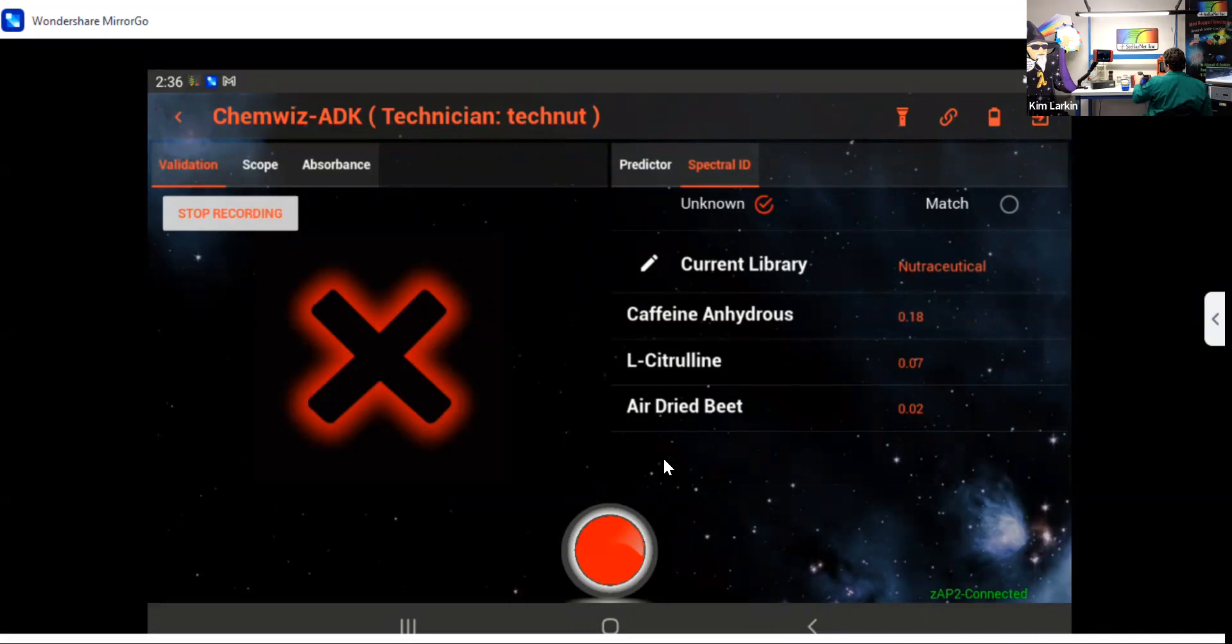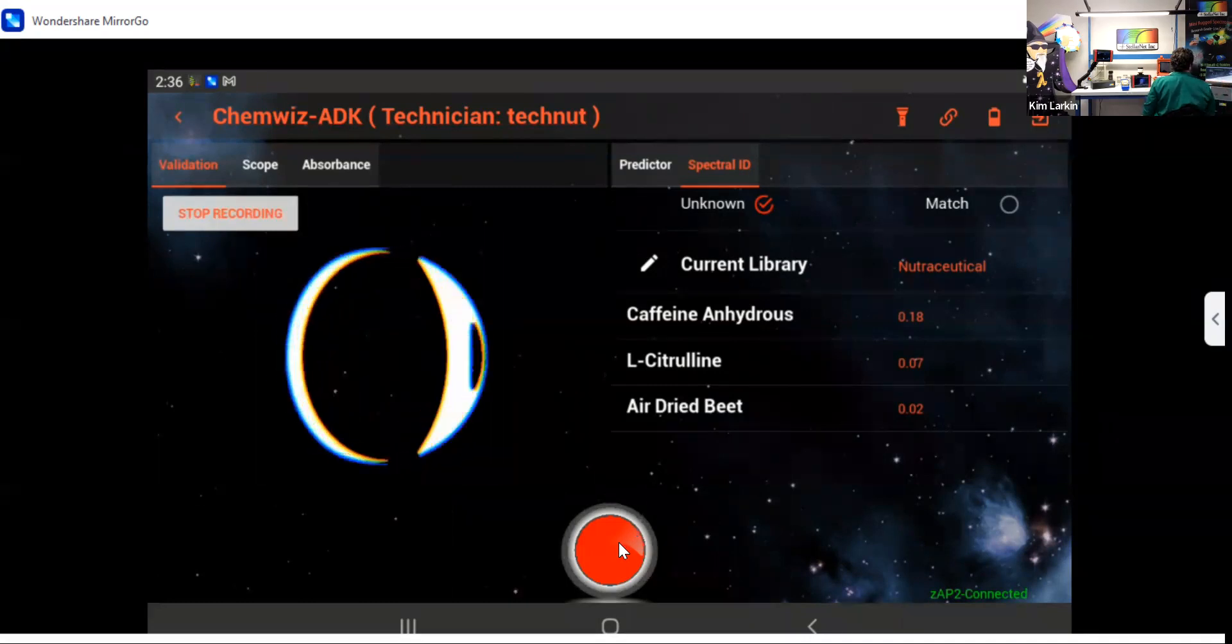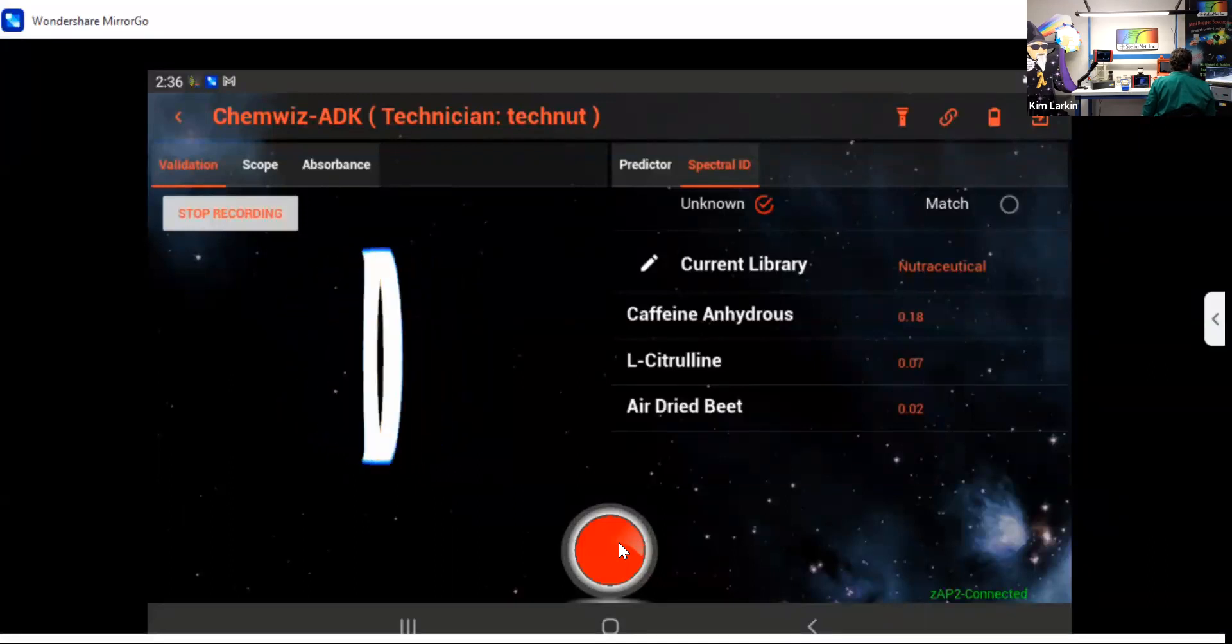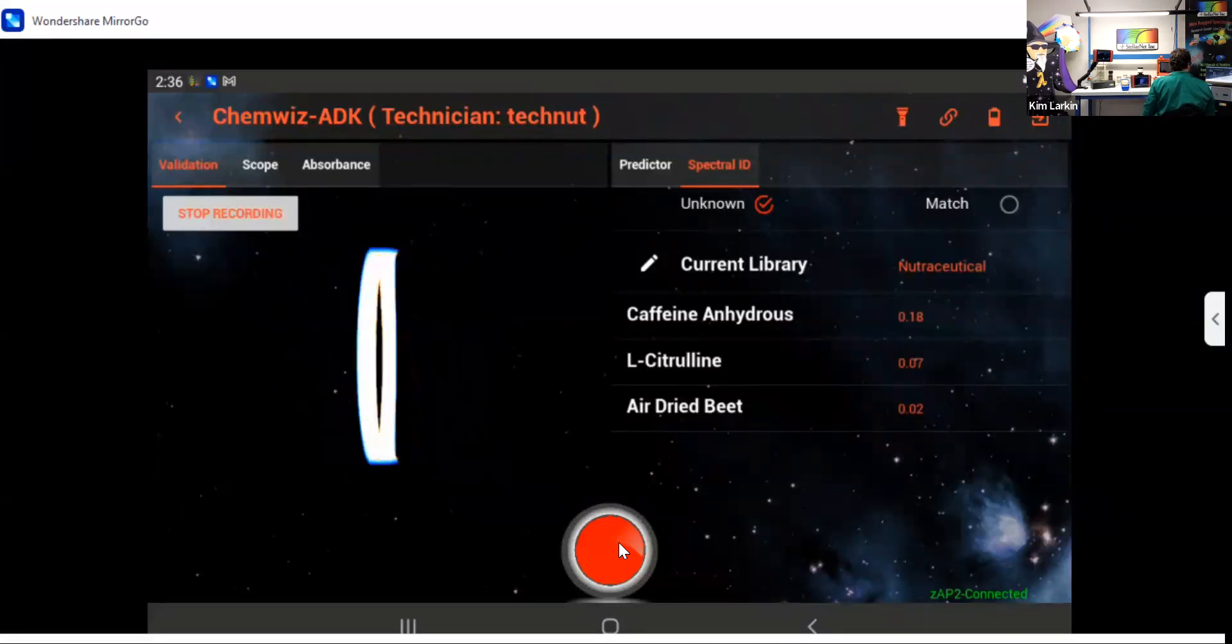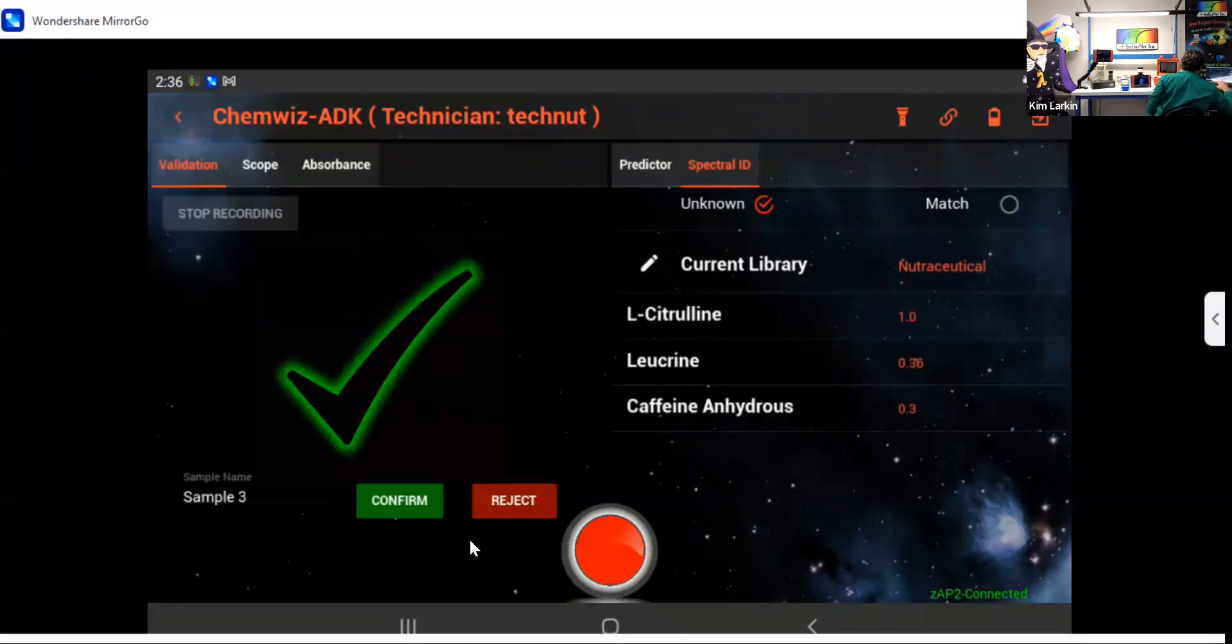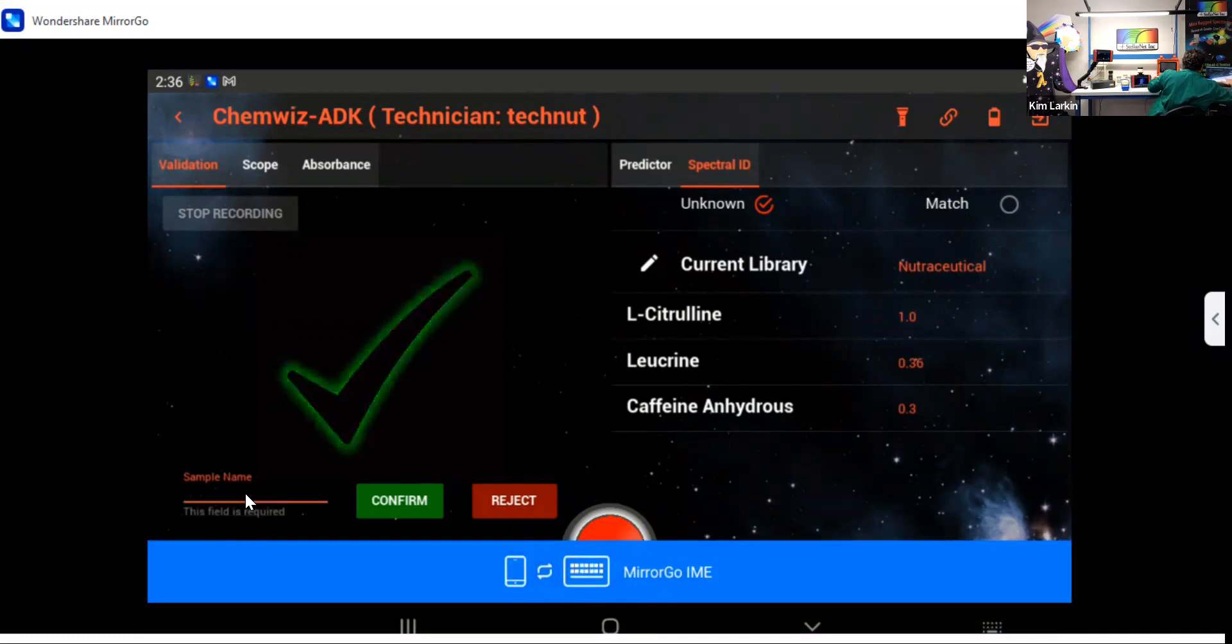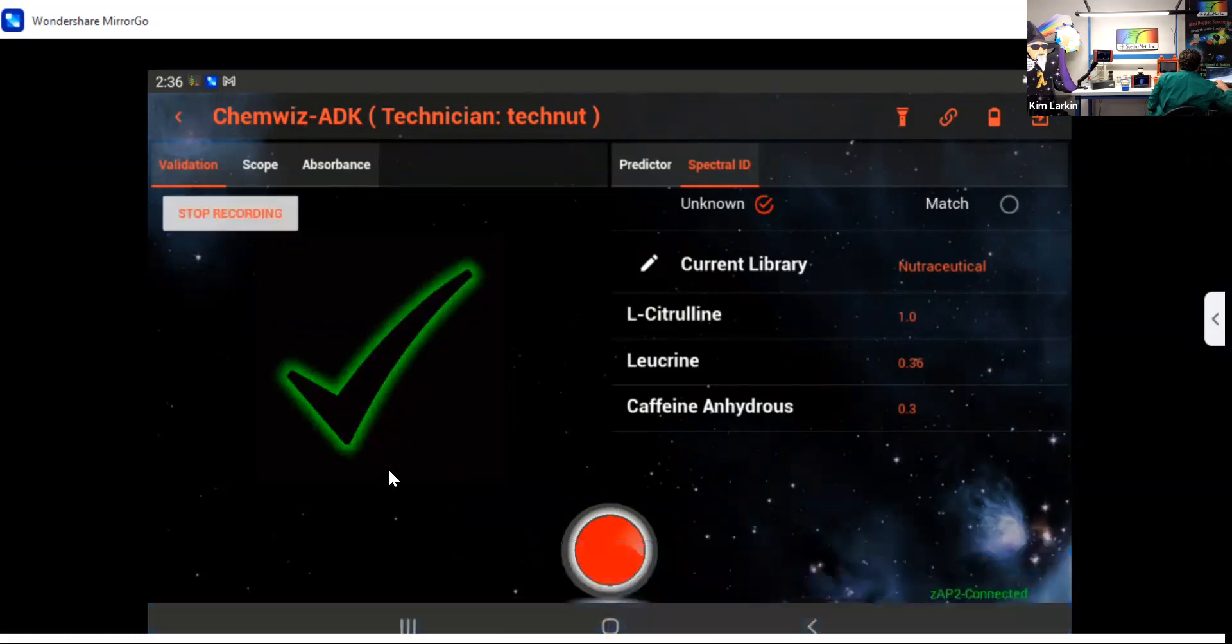The next one we're going to record is the L-citrulline from our previous demo. This was the unknown that we added to the library. And we get a match for L-citrulline. So I'm going to give it a name, 03, and confirm it.